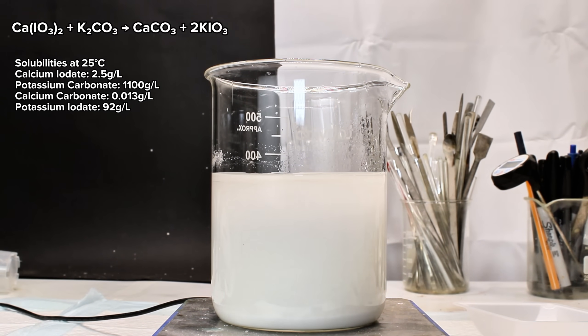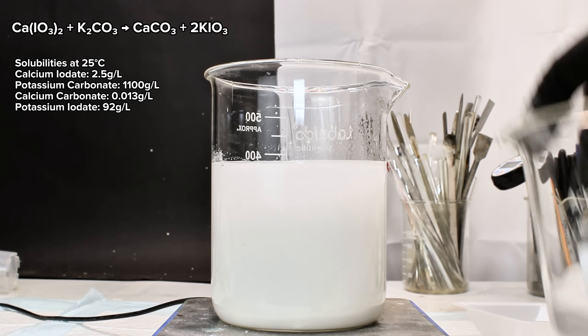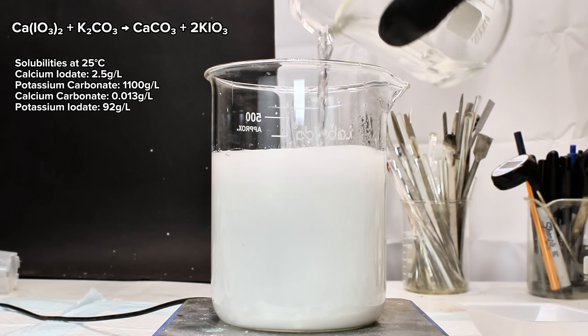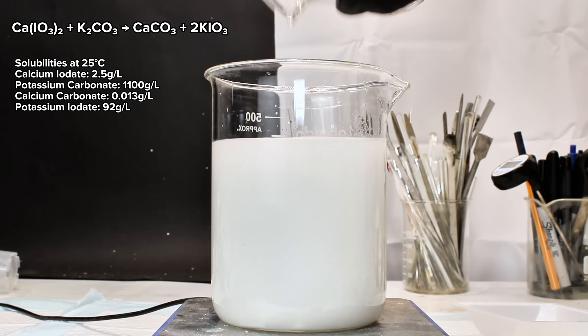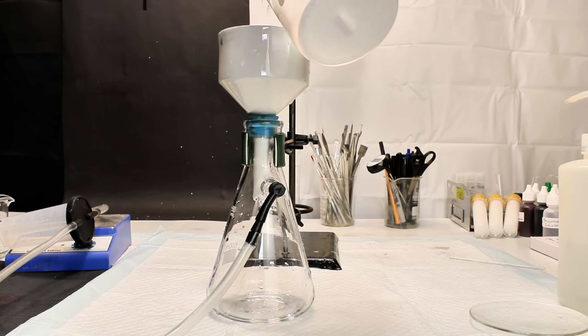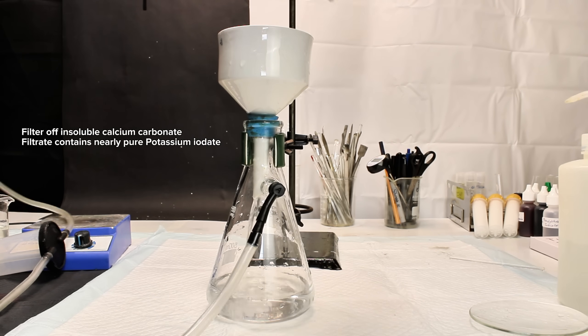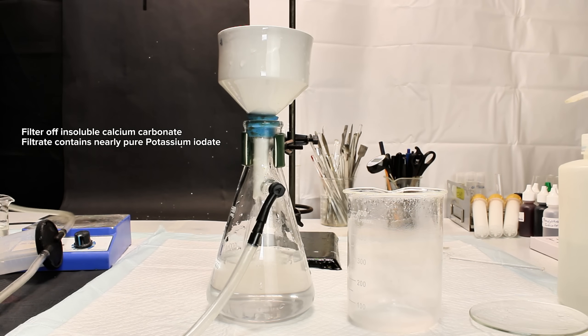What's happening here is a double displacement reaction that isn't quite as dramatic as most other similar reactions — in fact, it isn't really apparent that anything is happening at all. Basically, the idea is that even though calcium iodate is only sparingly soluble, it does still have a solubility of around 2.5 grams per liter at room temperature. Calcium carbonate, however, only has a solubility of around 0.013 grams per liter at room temperature, giving it around half of 1% the solubility of calcium iodate. This makes the formation of calcium carbonate very favorable, and given enough time, all of the calcium iodate and potassium carbonate will react forming soluble potassium iodate and insoluble calcium carbonate.